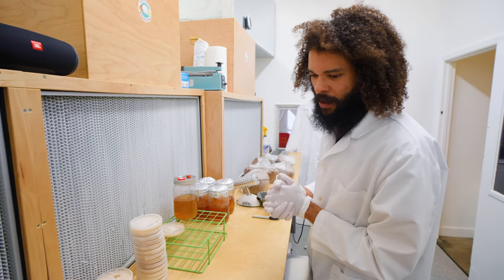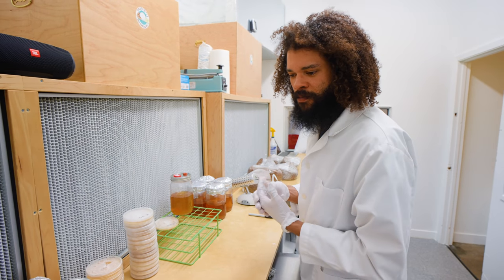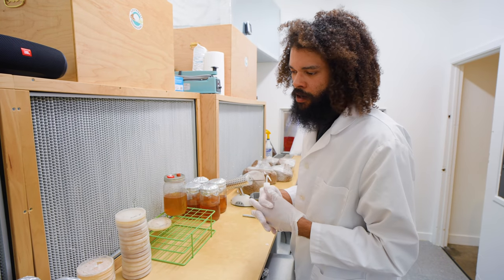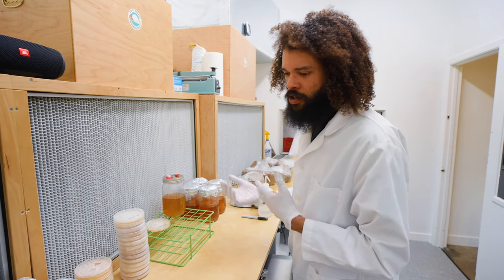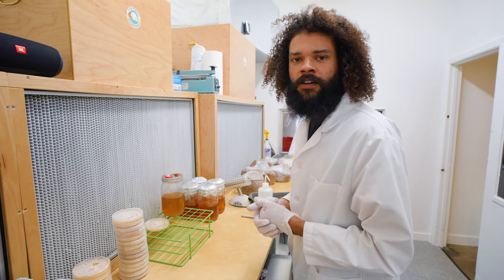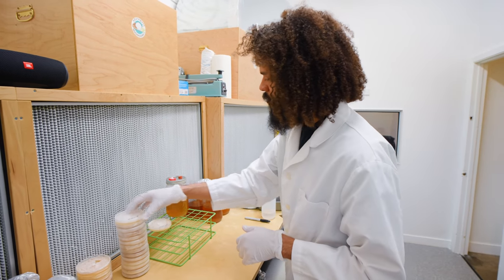We're basically trying to back up the whole library. This is the majority of the strains we grow — not all of them — but we're turning it all into a liquid culture reserve to have on hand, because sometimes it's really nice just having that liquid culture available.